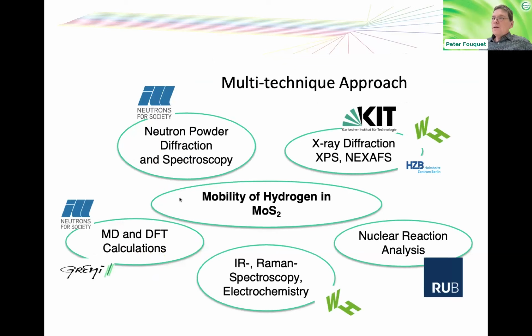part of REMADE, most notably, of course, neutron powder diffraction and spectroscopy, but also different X-ray techniques, diffraction, spectroscopy, XPS and NEXAFS, but also ion beams, nuclear reaction analysis, and infrared and Raman spectroscopy.